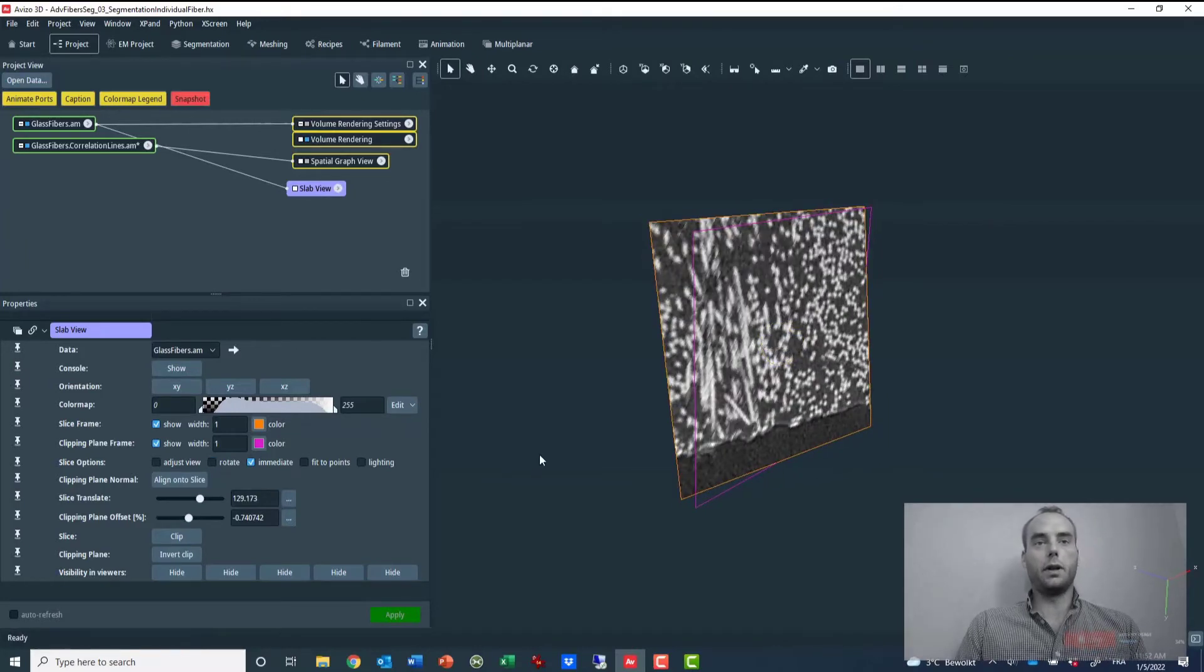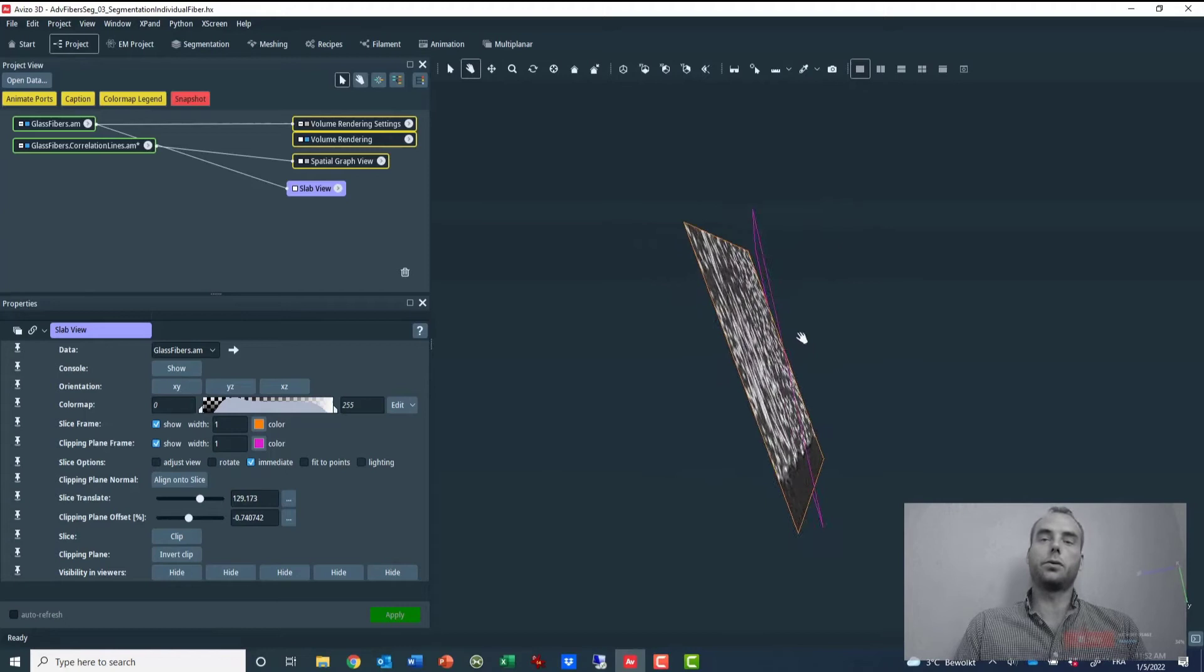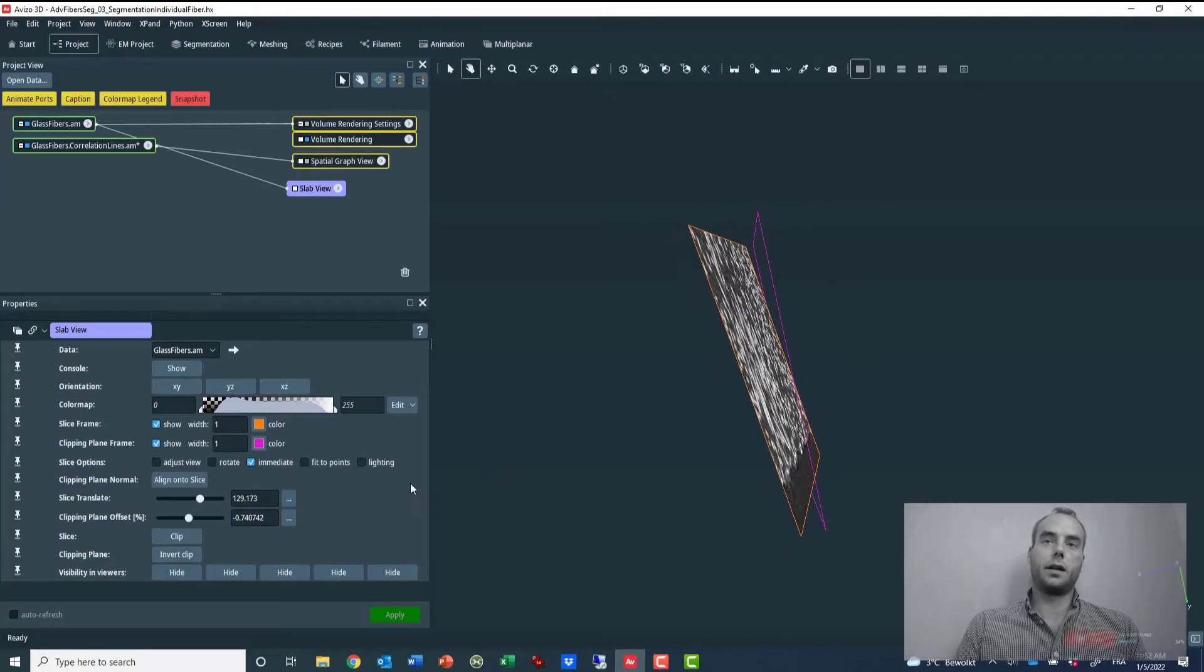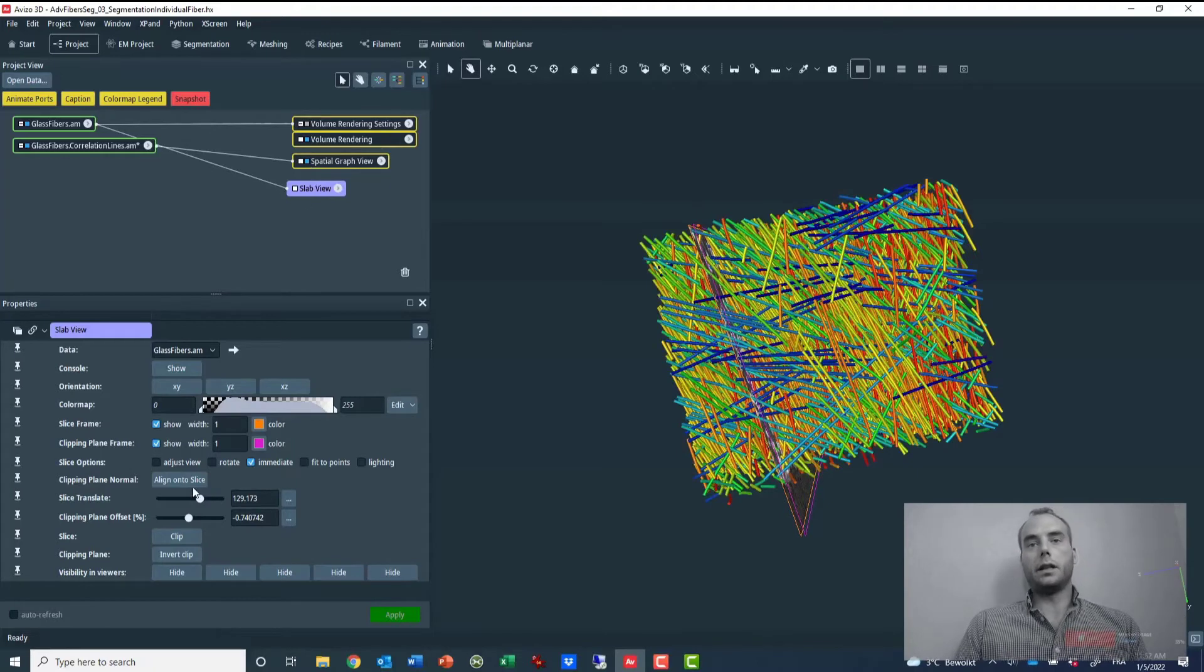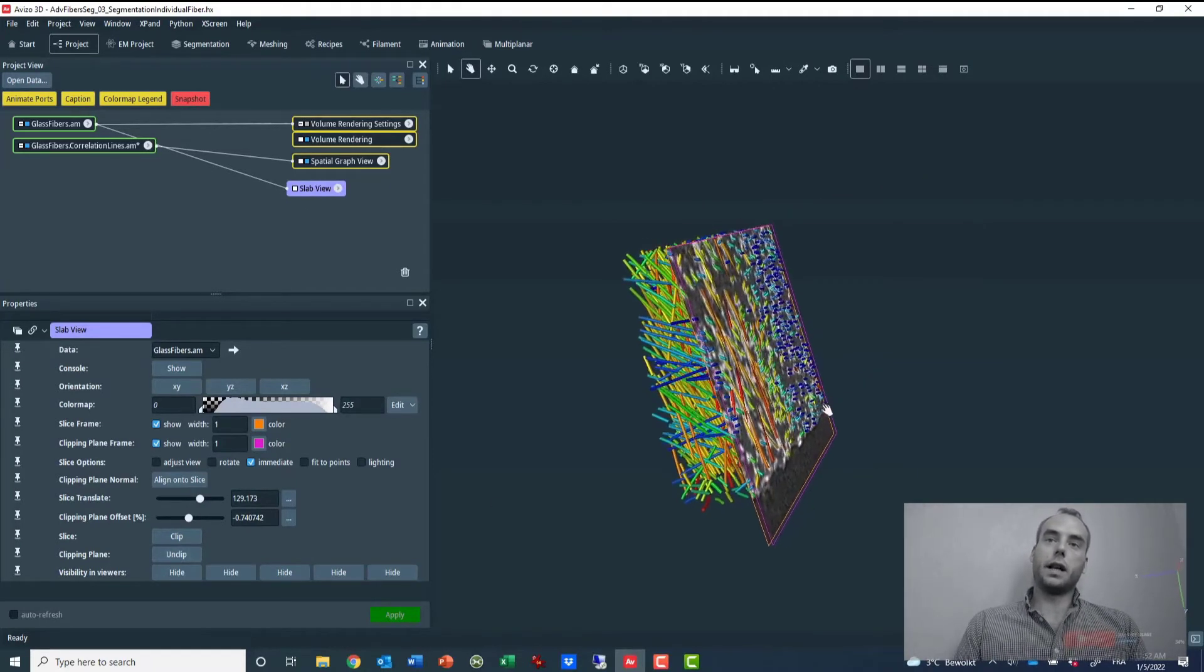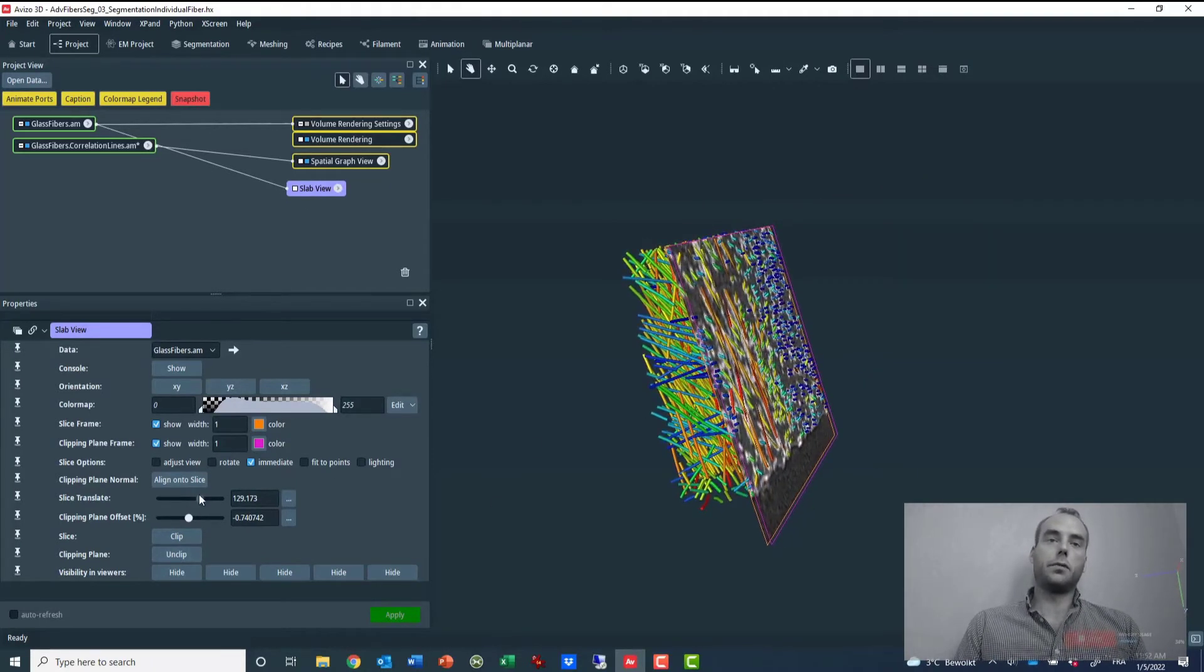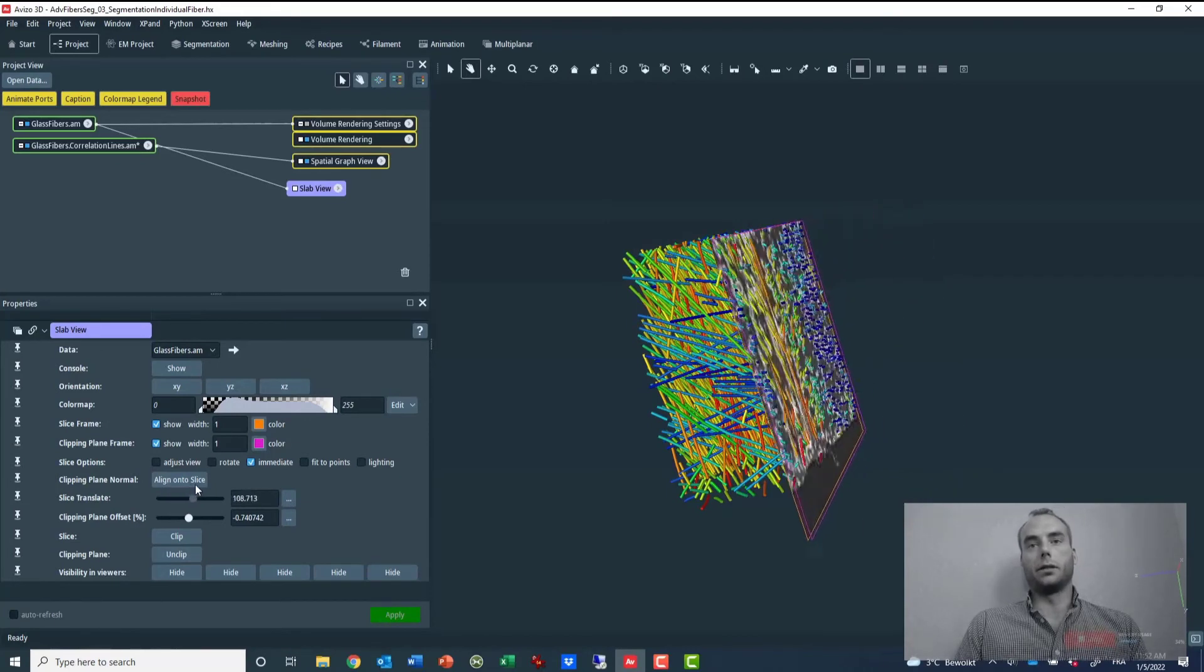And I will need to realign the clipping plane onto the slice, just by clicking on this button. Finally, I can show again the rest of the scene and carry on with the clipping and my inspection.